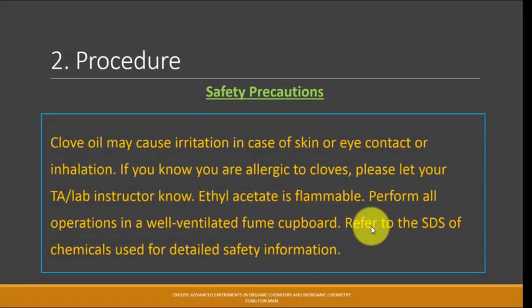Next, safety precautions. Supremely important to you. I need to read this out to you. You have to read it again and again. Do not think that because clove oil is used as a form of essential oil on the body, it is really safe. Like oil, it is flammable, right? It can cause irritation, it's a form of chemical. So clove oil may cause irritation in case of skin or especially eye contact or inhalation.